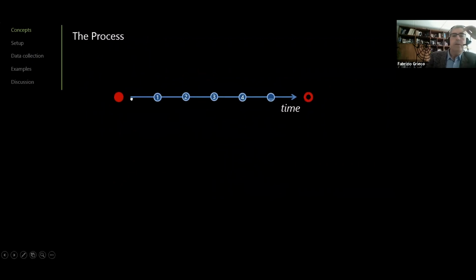Well, just imagine this is your trial, and this is the starting point. So when you click the Start Trial button, and this is your stop time. So when you click the stop trial button, or at the end of the video, or when the trial control procedure tells you that the trial is stopped.